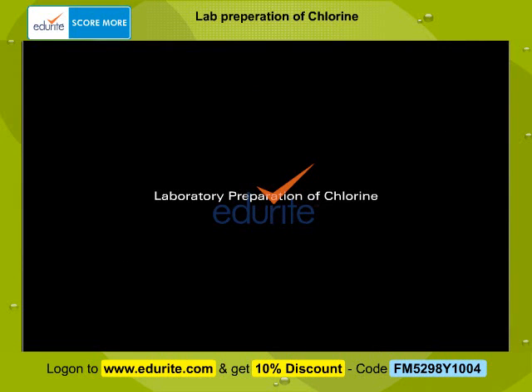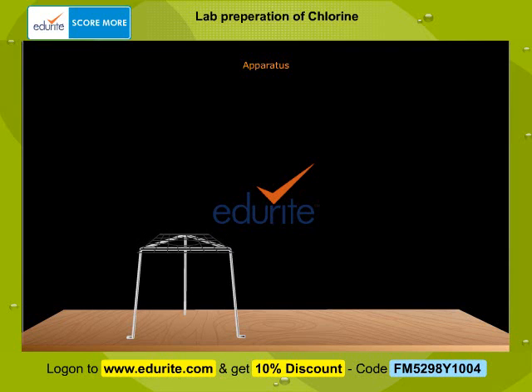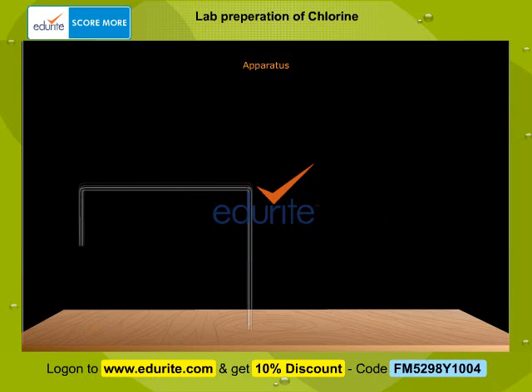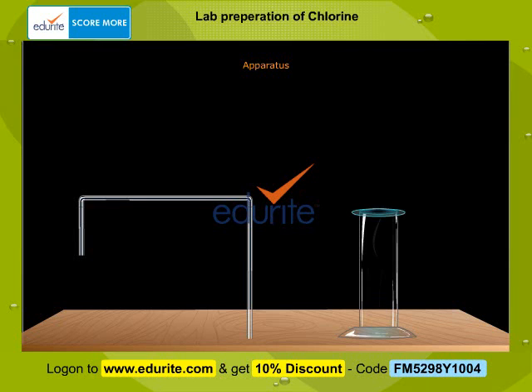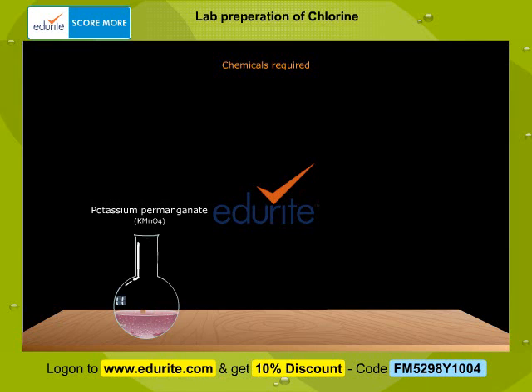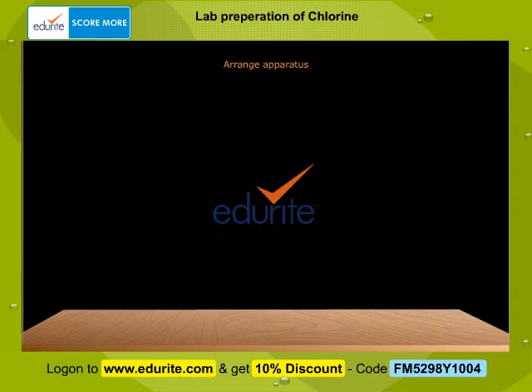To prepare chlorine gas in the laboratory, the apparatus required are a tripod stand, a burner, a round bottom flask fixed to a clamp, a thistle funnel, delivery tubes, and a gas jar. The chemicals required are potassium permanganate, water, concentrated sulphuric acid, and concentrated hydrochloric acid. Arrange the apparatus as shown here.